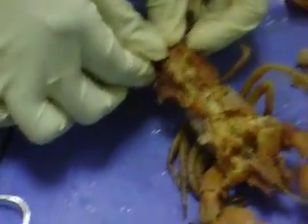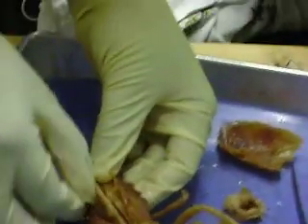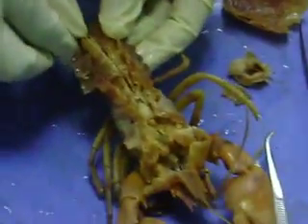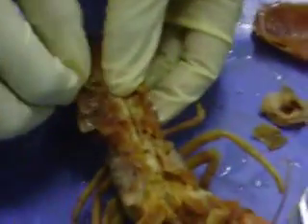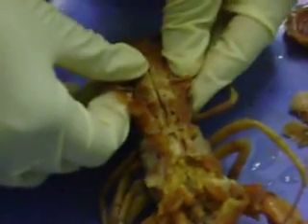So when we eat — crayfish, actually — when we eat crayfish, this muscle right here that she's trying to pull out, that is what we eat.